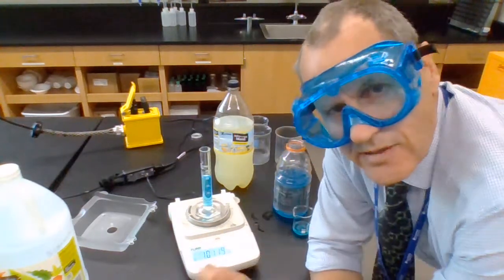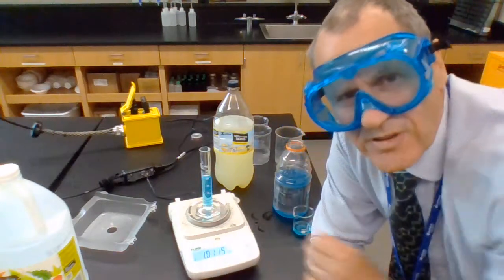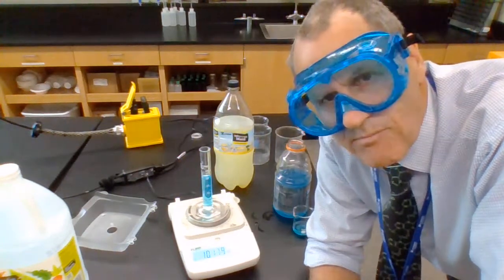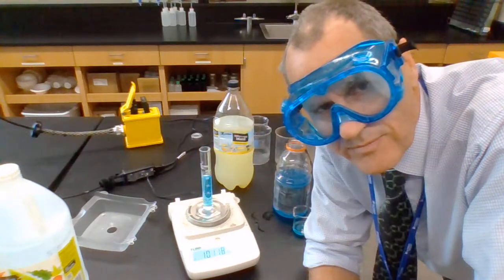So, there's a bunch of other stuff to do on the sheet, and you'll be able to do that yourself. But obviously, at home, you're not going to have access to all this equipment. What your job is to modify this experiment using the equipment you've got at home.